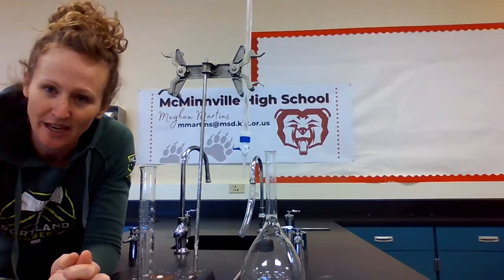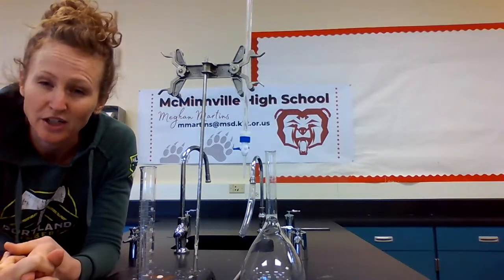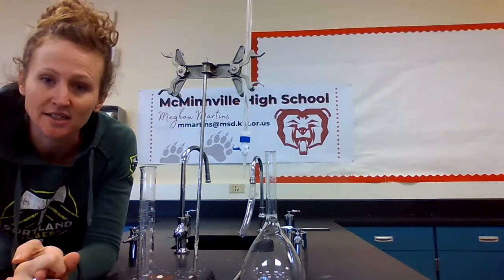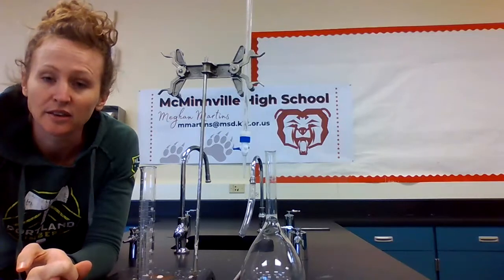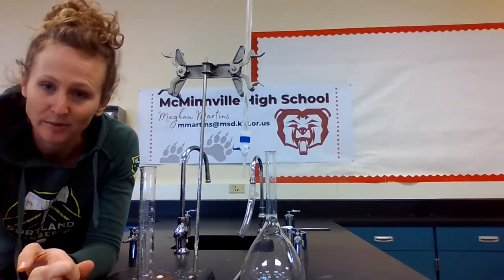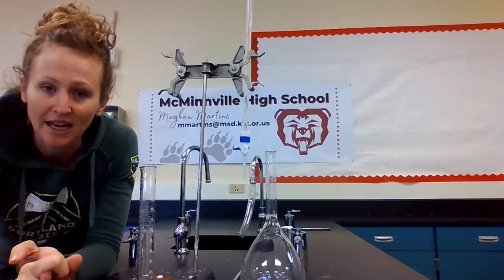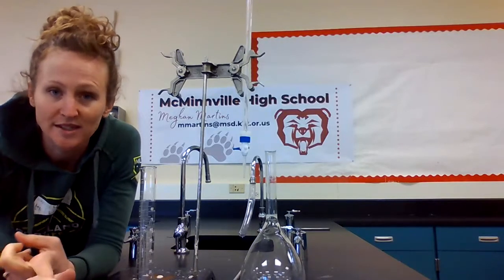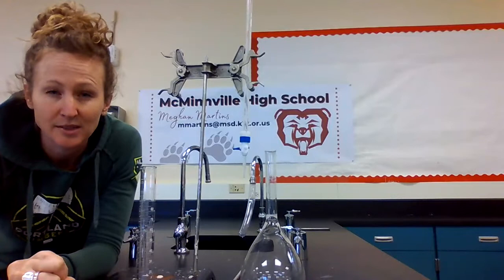And hopefully what you said was basically, I would want to know what's in the solution and how much of it is there. And that's exactly what these analyzation techniques are designed to find. So we have done an analyzation technique already in lab. It was our first 2 labs. We used a spectrophotometer, and that's exactly what we looked at in these solutions. What was there and how much of it was present. Right? But not everything can be evaluated by a spectrophotometer.